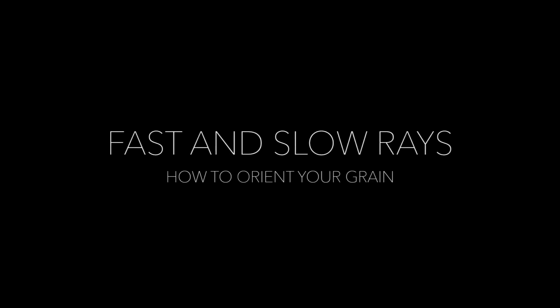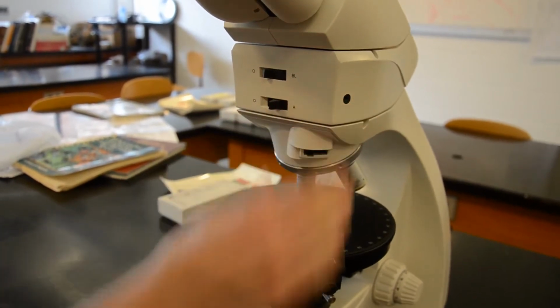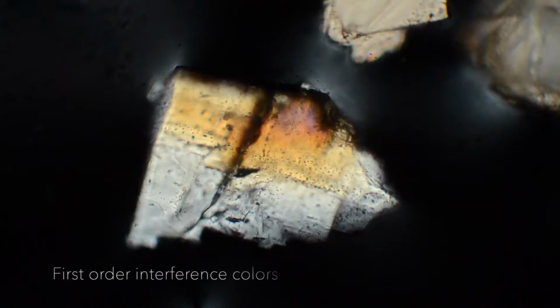In this video, I will go through the steps you would take to orient your grain along the fast and slow rays of a mineral. First, you will need to work in cross-polarized light. Here, I insert my analyzer. The grain we see is displaying first-order interference colors in cross-polarized light.